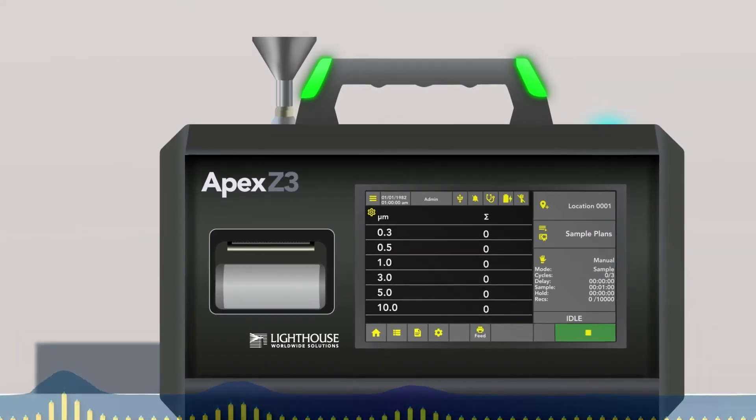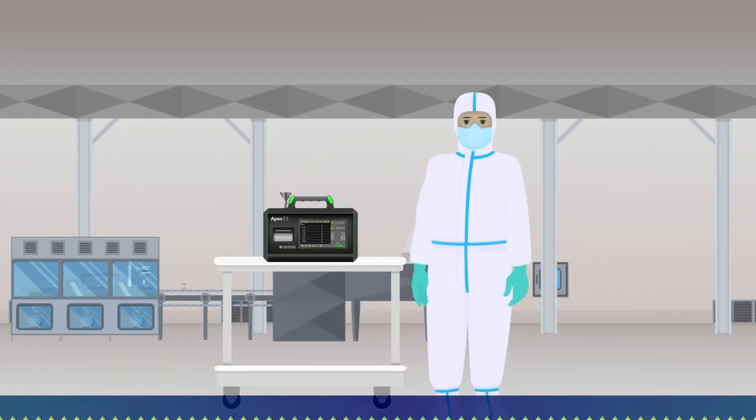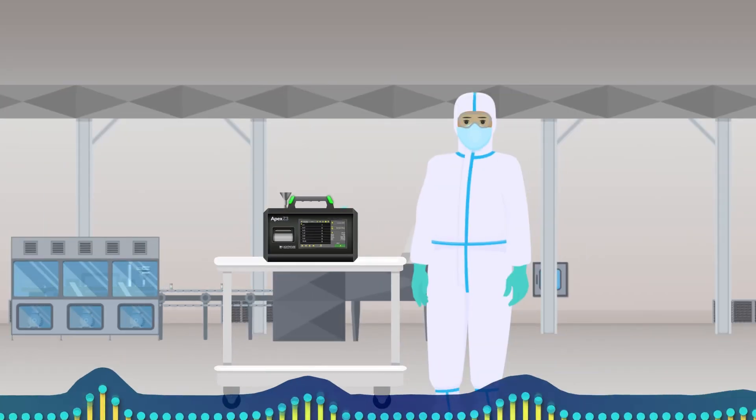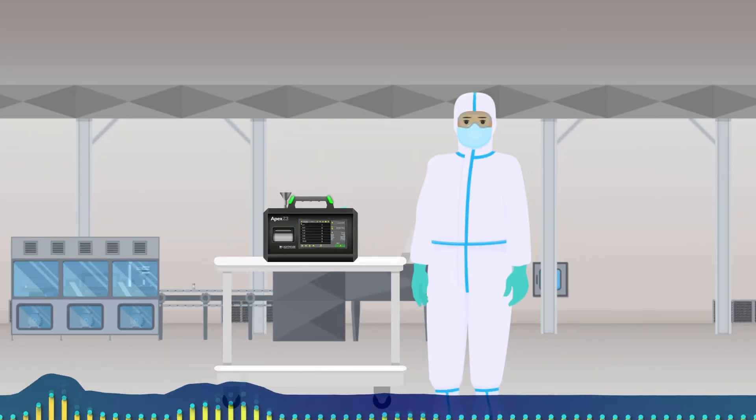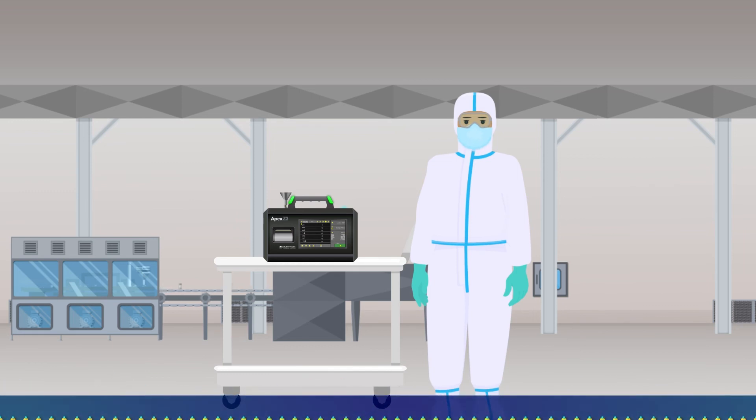It's that easy. You just entered all of your sample settings and you're ready to begin sampling.